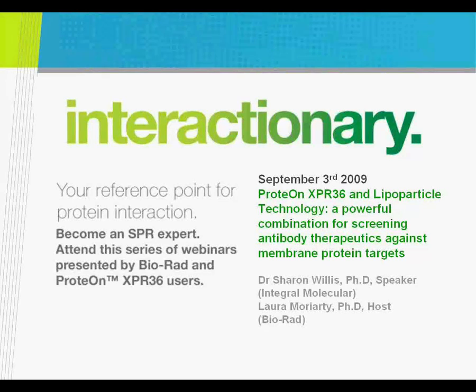We had a panel of 6 Ricin antibodies, and one of them binds very well in ELISA and doesn't bind in SPR. I have this belief, and people anecdotally report it in the literature, that the reason is that most of the antibodies people deal with have been screened or selected using ELISA plates.